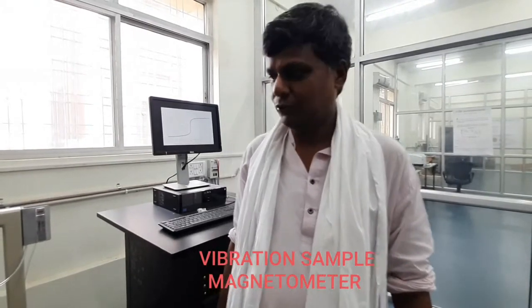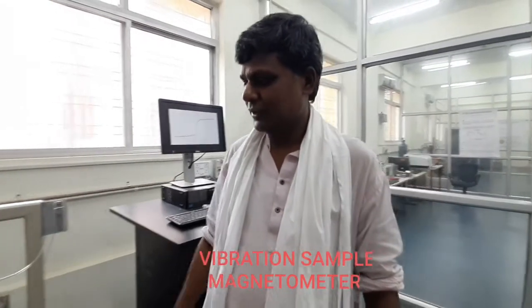Hello friends, Namaskar. Now we will discuss about the vibrating sample magnetometer equipment and its importance.